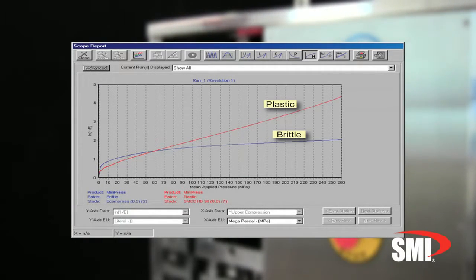The Heckel plot: a plot of the natural log of 1 over E, where E represents porosity against the applied pressure, providing information about the initial packing properties and material yield point.